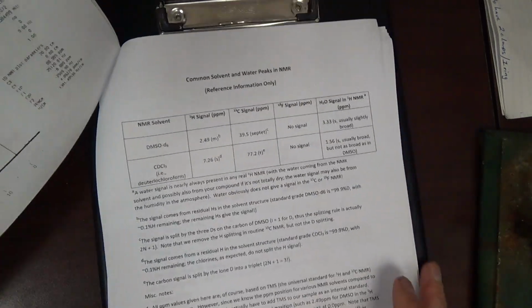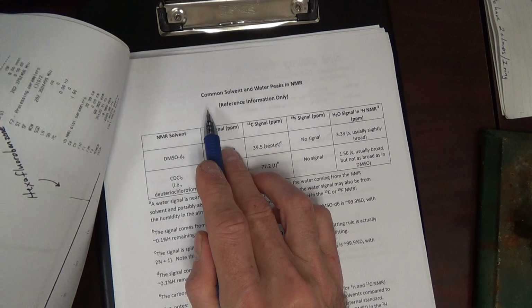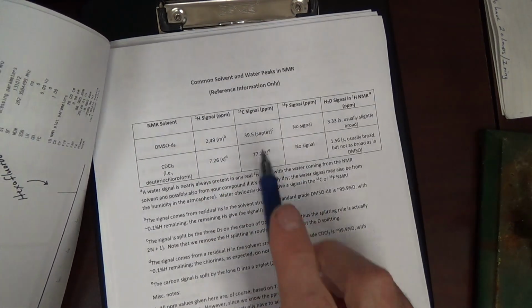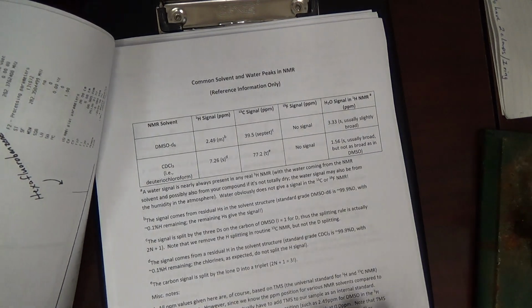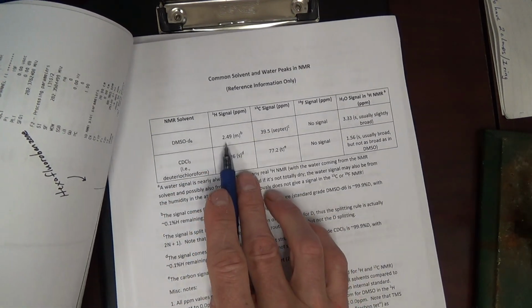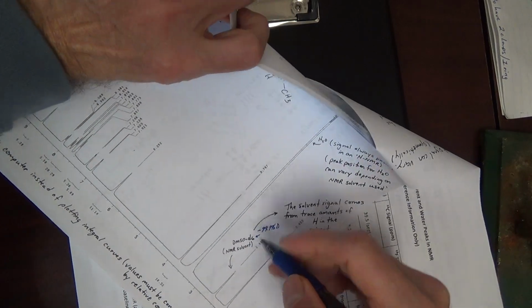Now, on the very back of the handout, I include a sheet which tabulates peaks for common solvents and water. All right? DMSO D6. It gives a signal at 2.49. All right? 2.49.